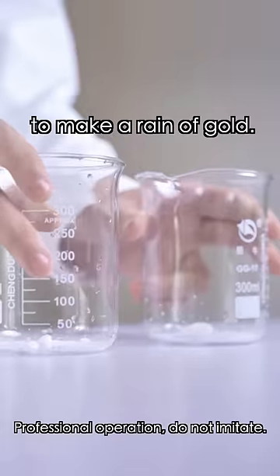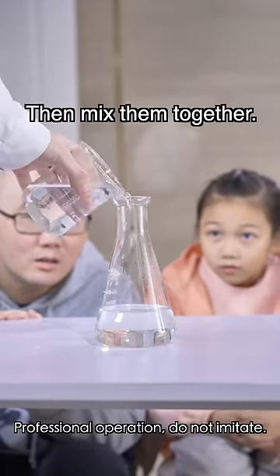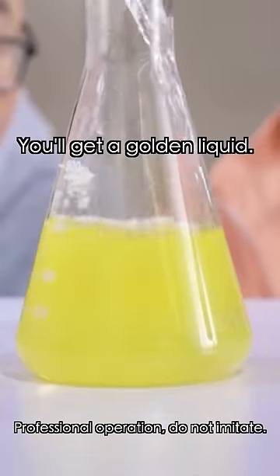These are the reagents we use to make a rain of gold. Use hot water to dissolve them separately, then mix them together. Look at it — you'll get a golden liquid.